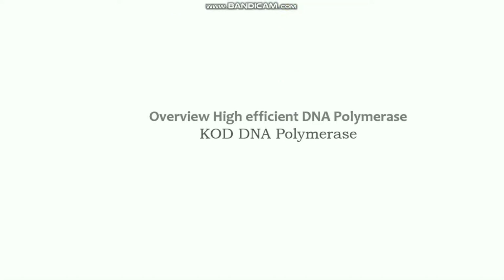In this tutorial video, I'm going to talk about an overview of the highly efficient DNA polymerase, that is the KOD DNA polymerase. And this tutorial video will help you to pick the right DNA polymerase for your PCR reaction.